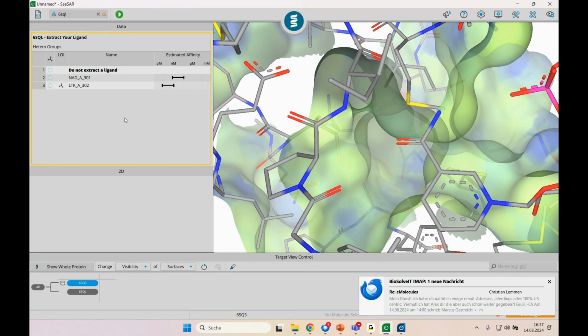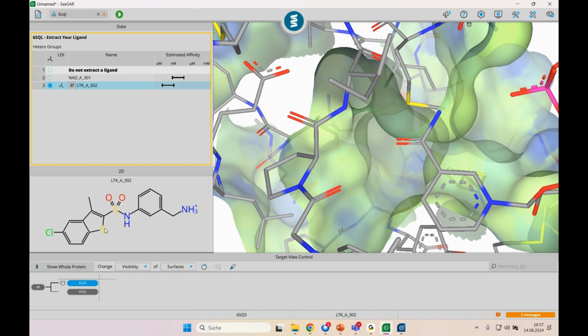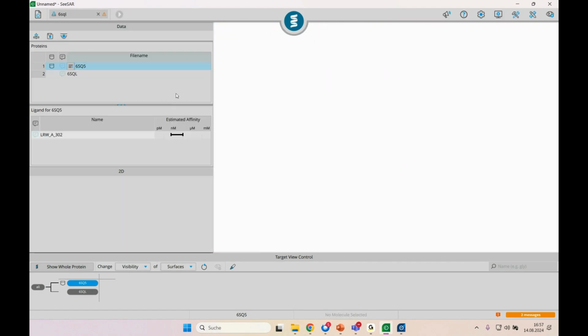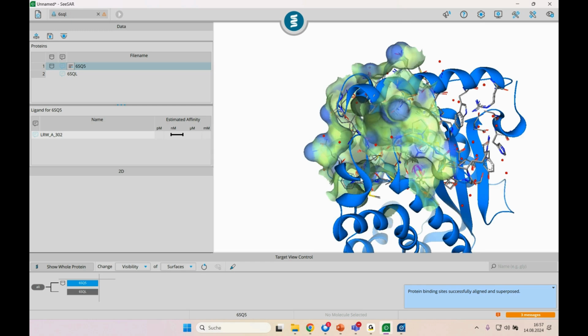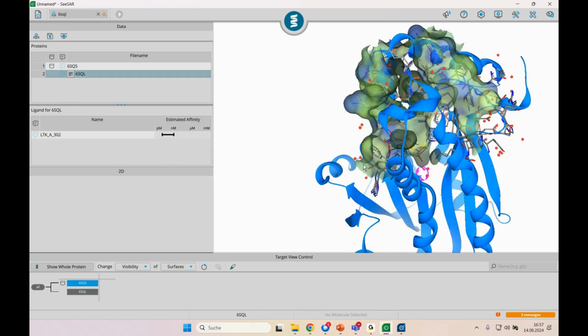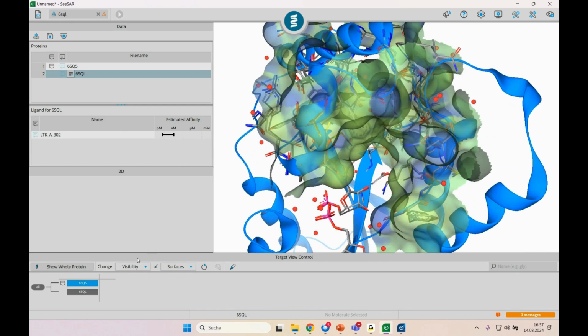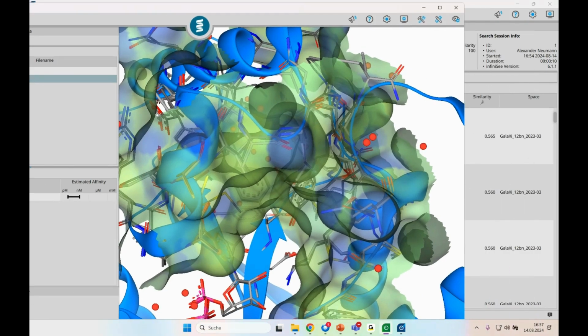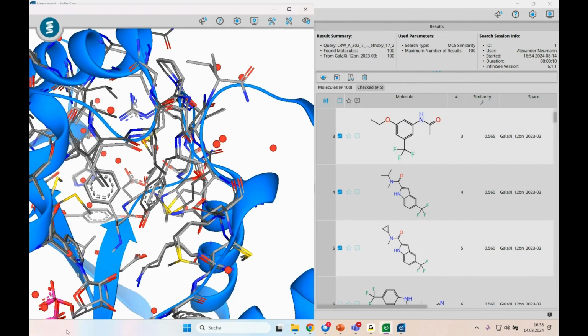Okay. So, one of the important things that I want to look at is to see how much the binding site has essentially changed between our first protein and the second. So this gives us somewhat of a feeling for what the induced fit has done, or what the conformational change that the newer molecule has produced. Because to me, it also seems that they've gotten rid of the trifluoro affinity anchor themselves. I'll quickly just move the chain.